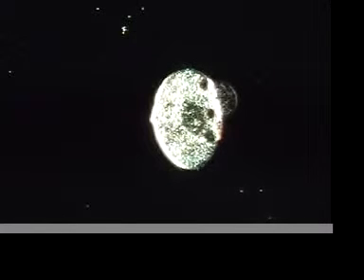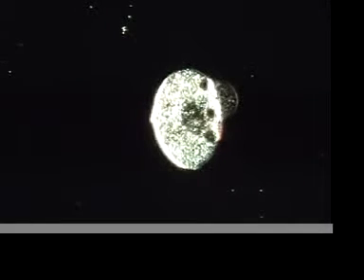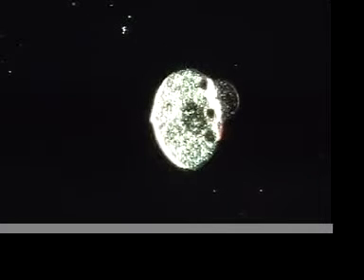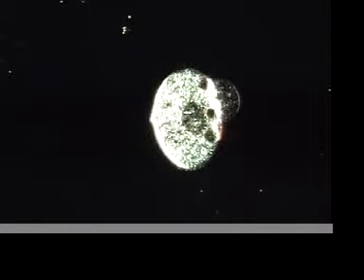Because we are using an inverted microscope, we have a different view than we have had in previous transformations. And perhaps we are seeing some information here which will be revealing of what's causing these effects. This is a live morphological transformation of the Paramecium caudatum caused by a rife bear plasma device. We'll take a quick photograph for the archive.